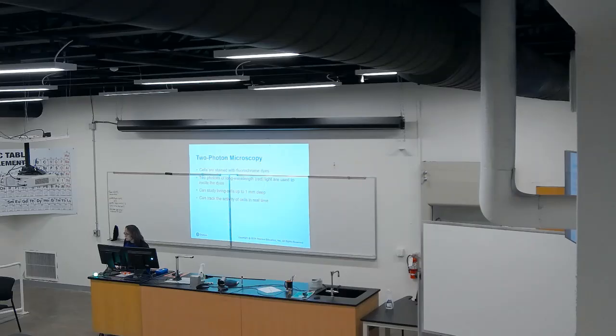Okay, so in the last lecture we were looking at different types of microscopes, starting from less sophisticated to more sophisticated. So this is one of the ones that is sophisticated because it helps us to see the detail of any object with much better resolution, and also in some ways, depending on the microscope, it can give a three-dimensional image.